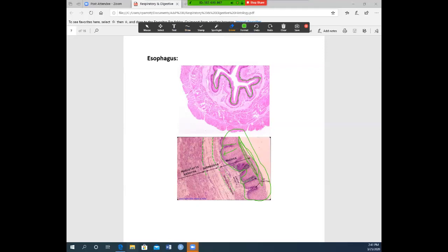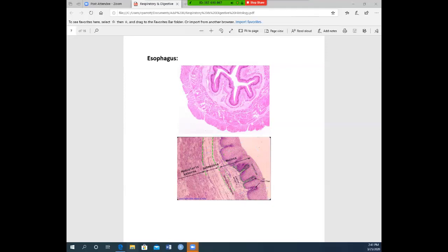When looking at the esophagus, the top picture shows that collapsed tube, and the bottom blown-up picture shows all of those stratified squamous epithelial cells lining it.